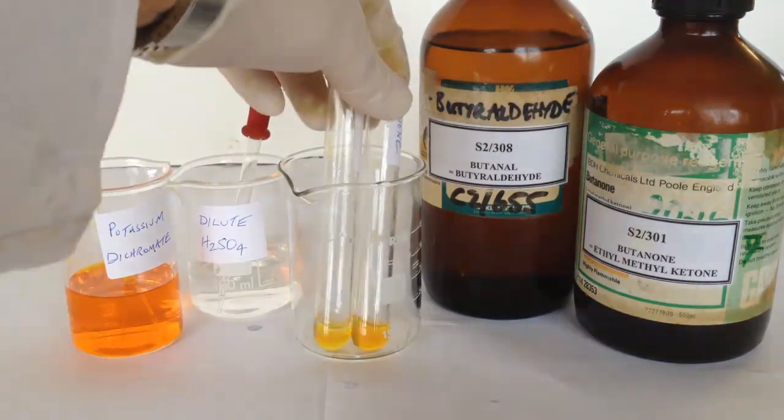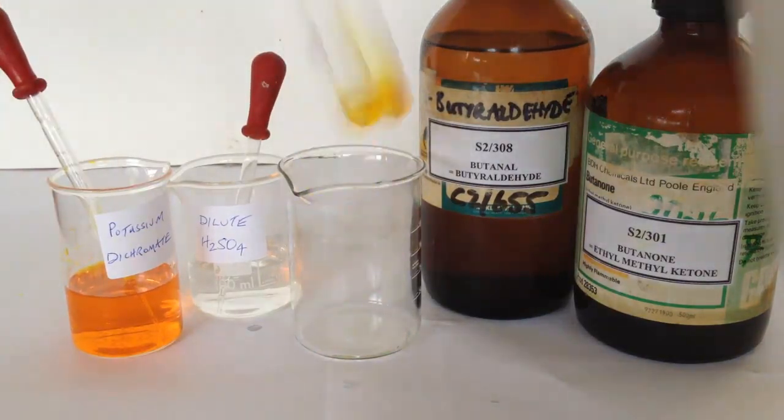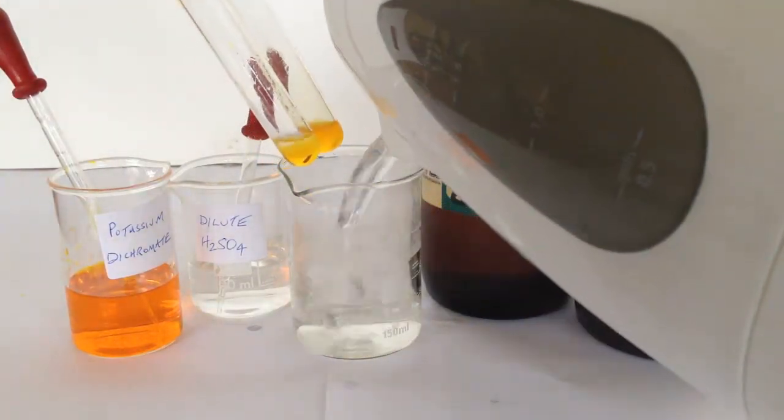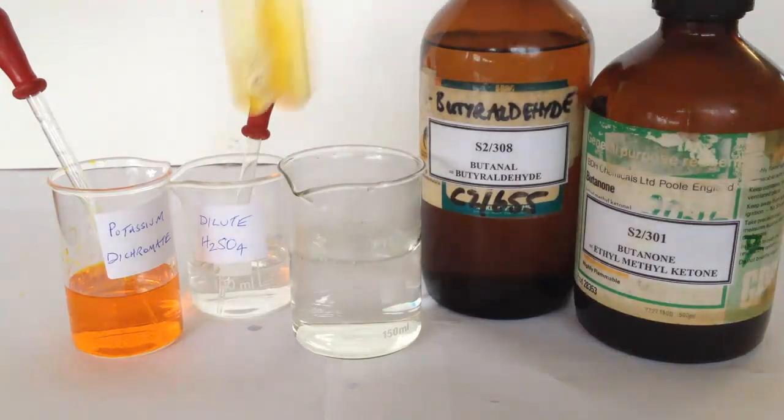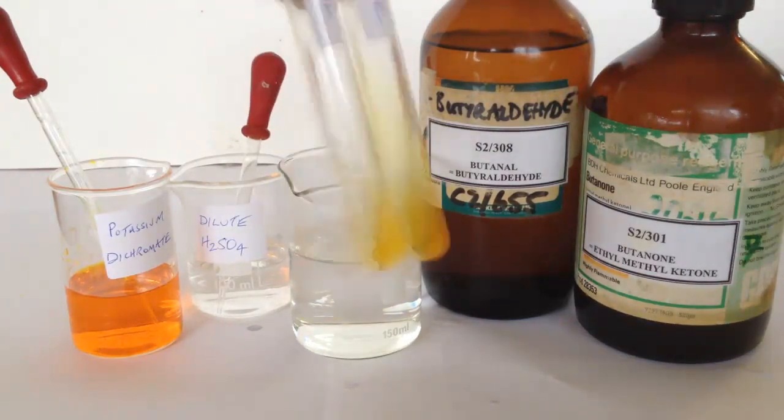So we now have the aldehyde and ketone mixed with acidified potassium dichromate. All I need to do is give them a good shake and place the test tubes in a hot water bath.